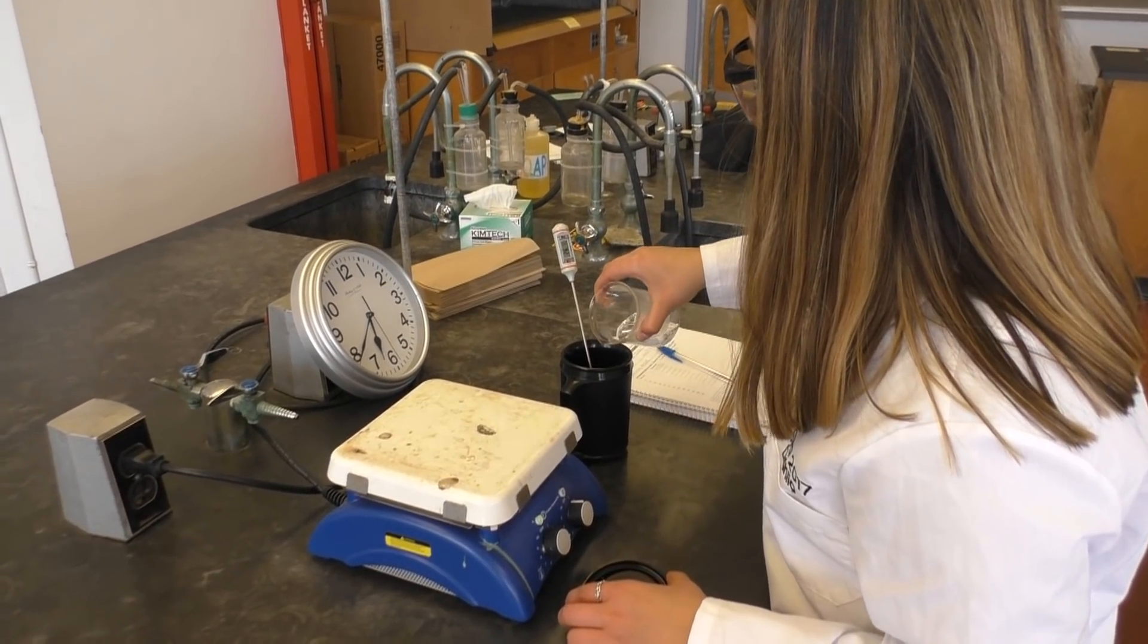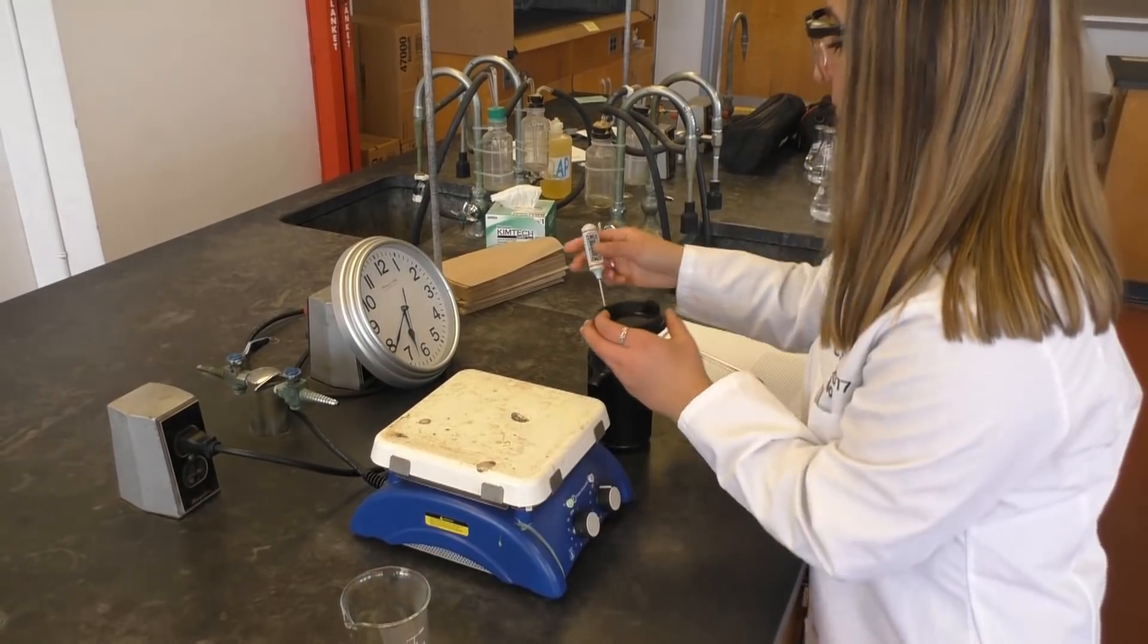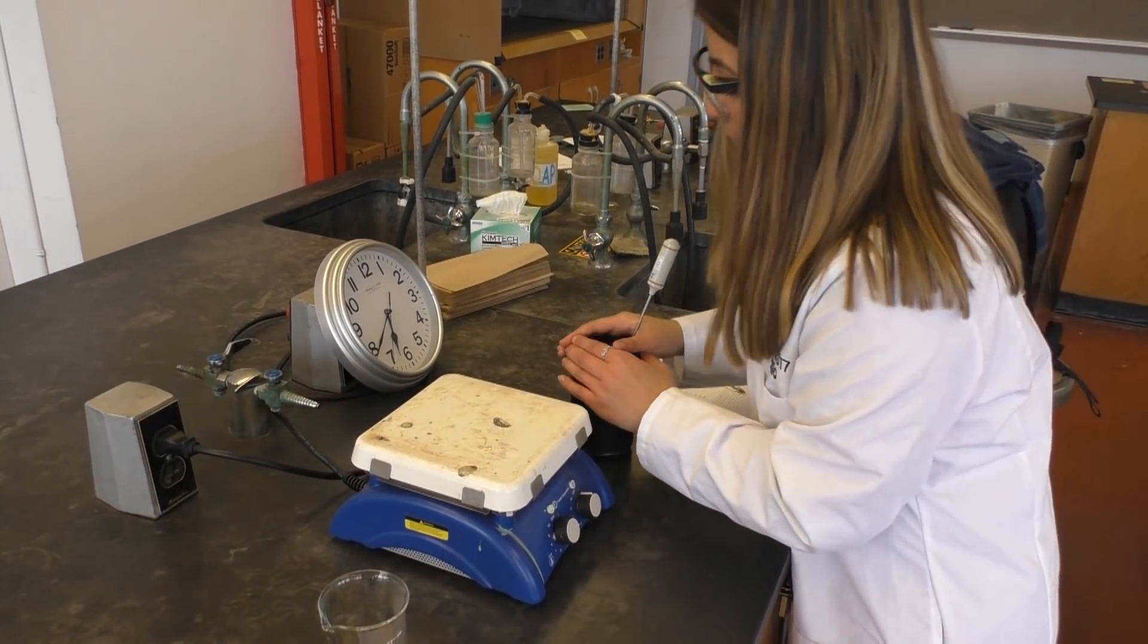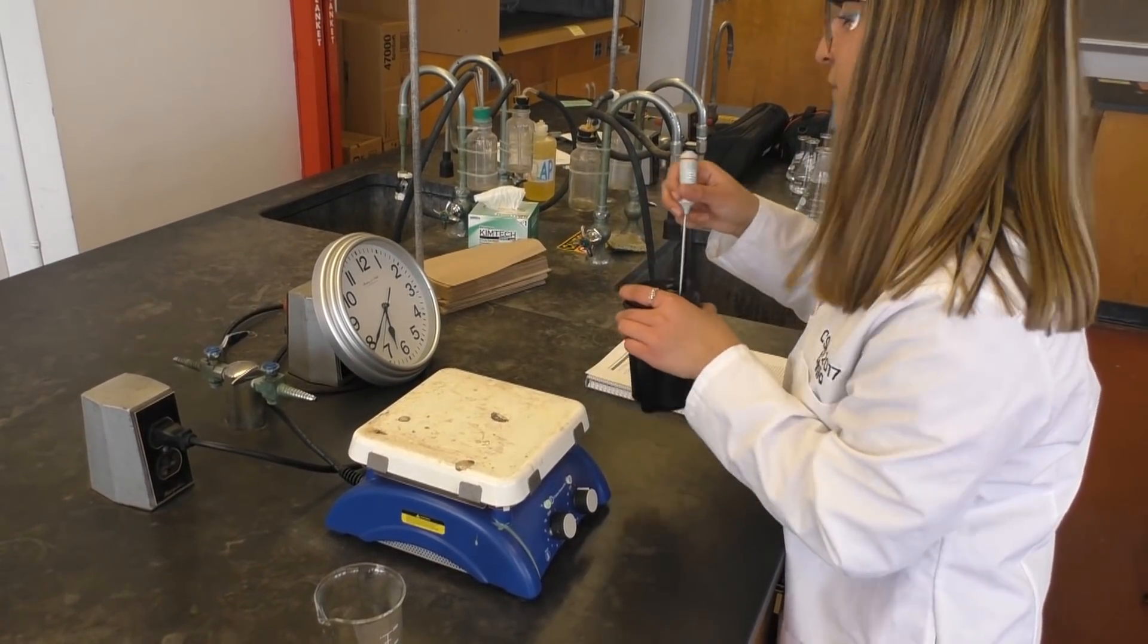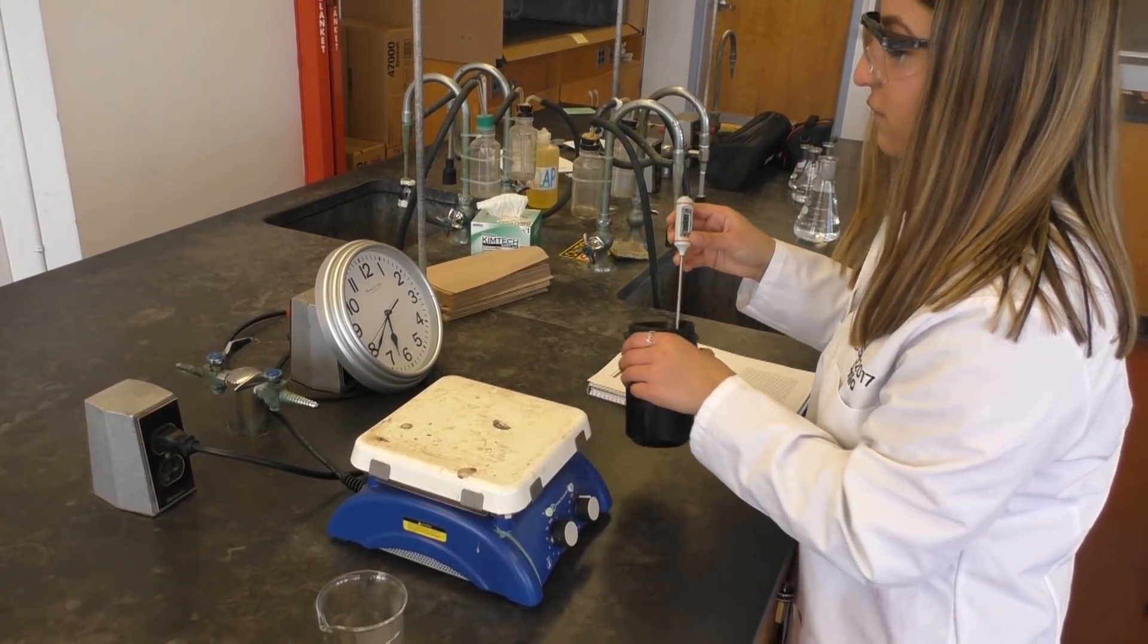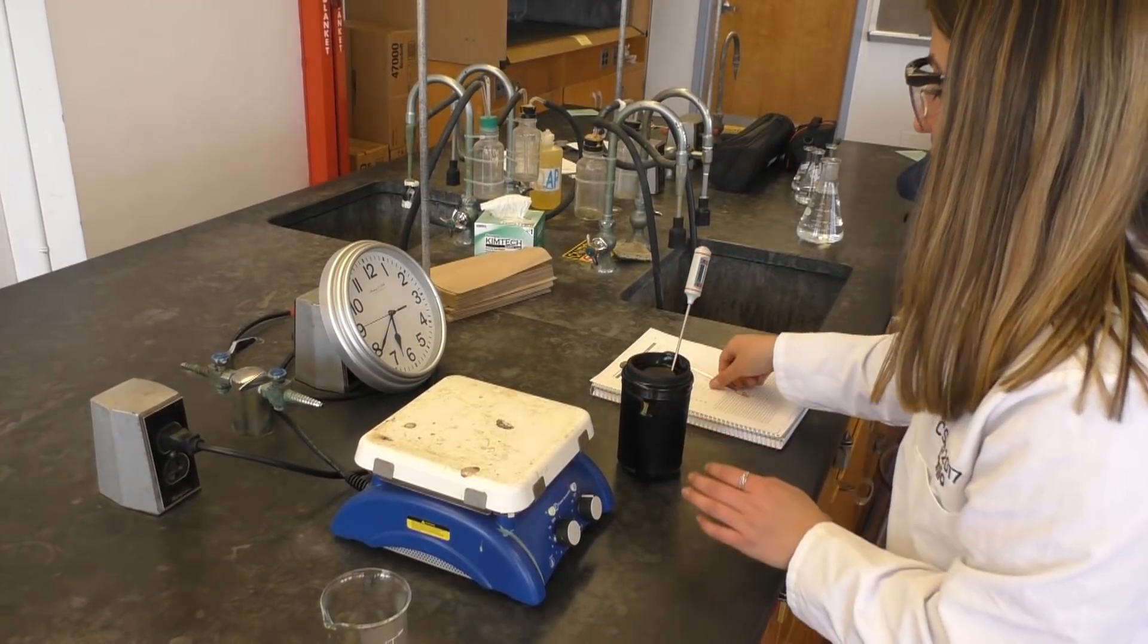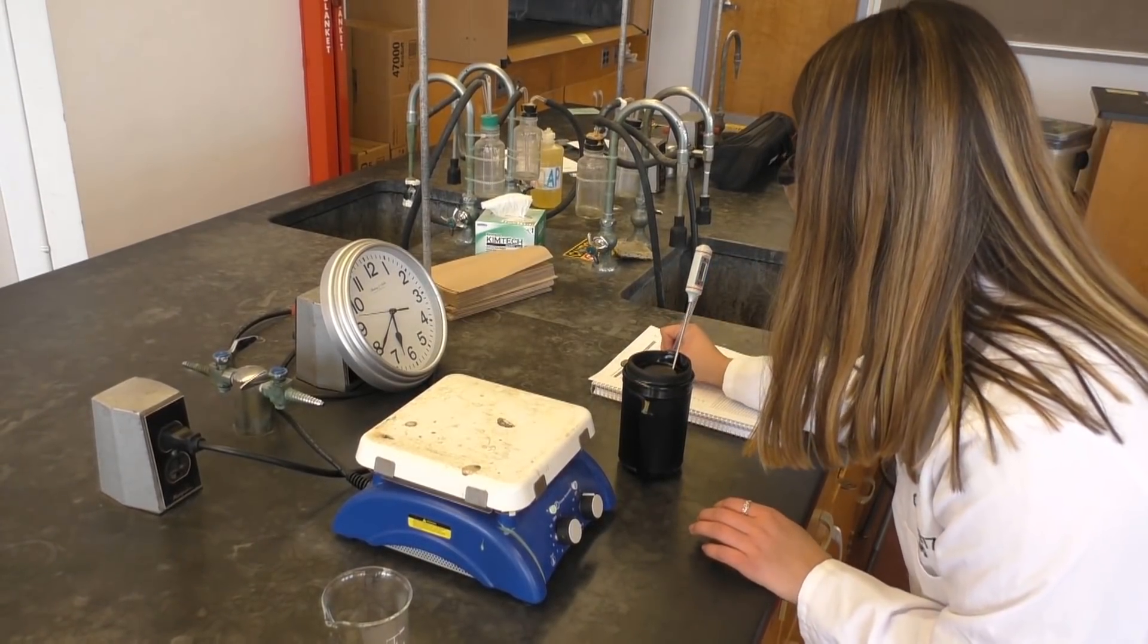Finally add the hot water all at once to your calorimeter. Cover it. Swirl it to mix the samples. Then record the temperature every 15 seconds for 3 minutes.